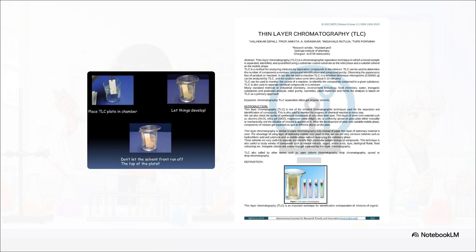But you have to watch this like a hawk. You must pull the plate from the chamber before the solvent front runs completely off the top edge. If you don't, all that beautifully separated data just becomes completely unreadable.